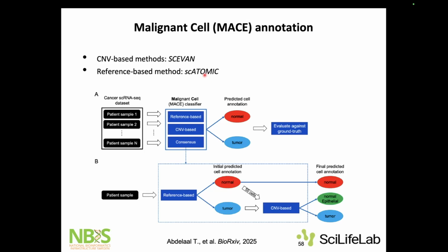In this paper, they compared it with the output, for example, of copy number variation based methods, which divide the data set into normal and tumor.